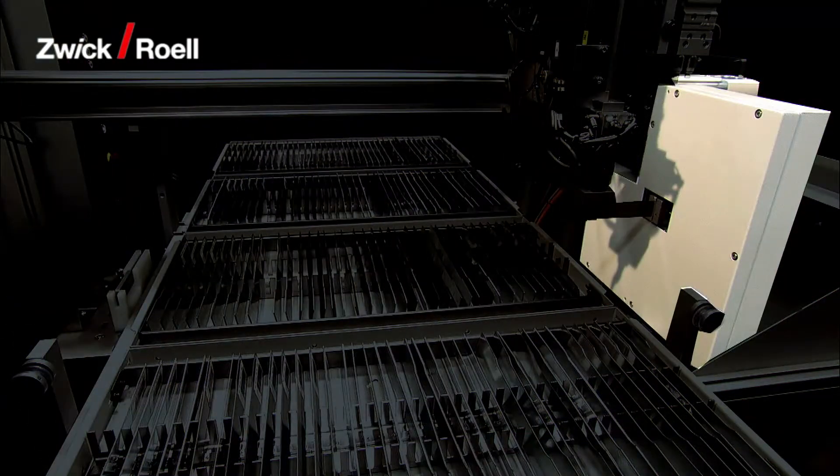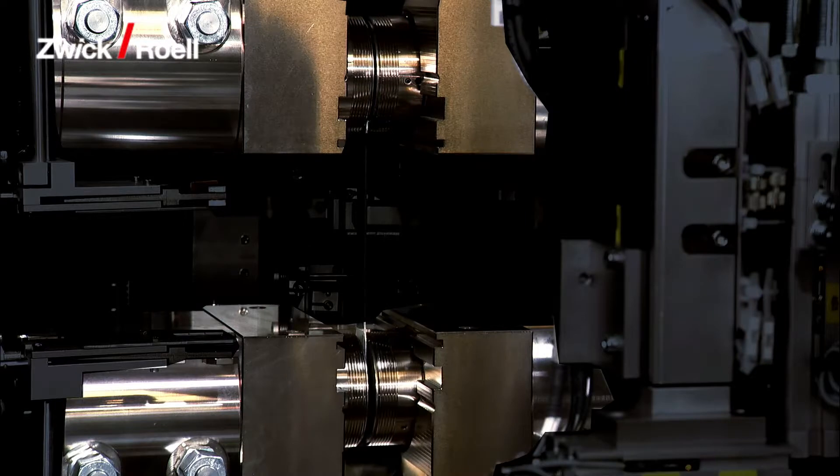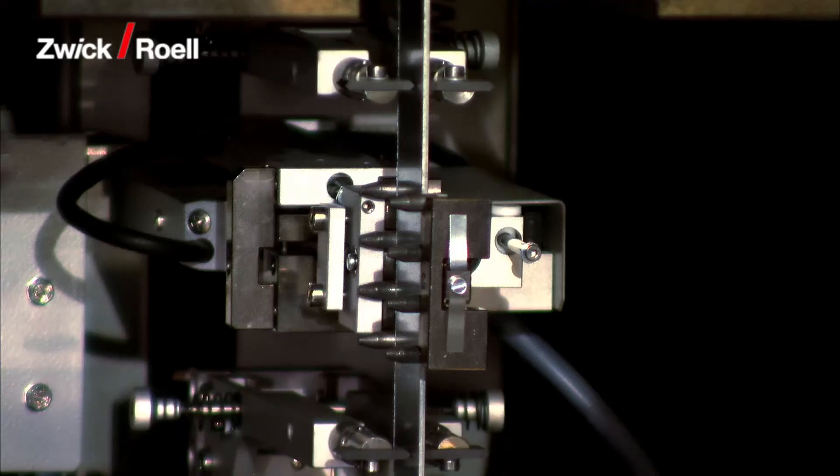The cross-section measuring unit for accurate, repeatable and reproducible test results, and the materials testing machine with hydraulic grips plus longitudinal and transverse strain extensometers for the tensile tests.